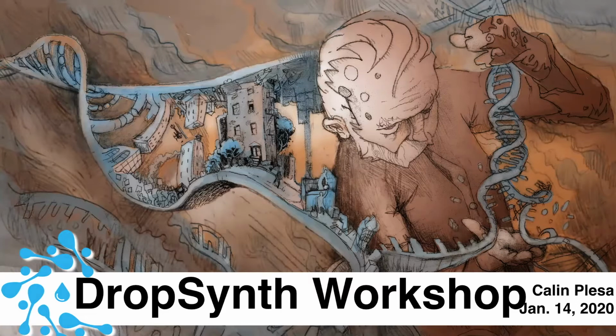All right, so you've got a system in mind that you want to study, and you've heard a lot about different methods that you can use to explore the local sequence landscape. But you find that your particular system has two properties. One, it's quite long, and two, in sequence space, it's very diverse. So what do you do?